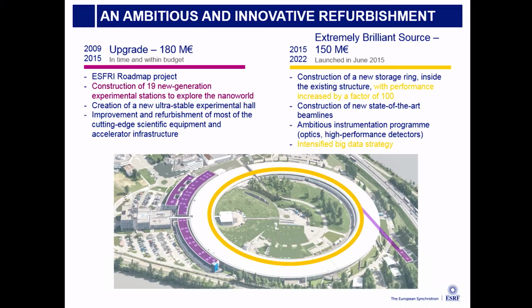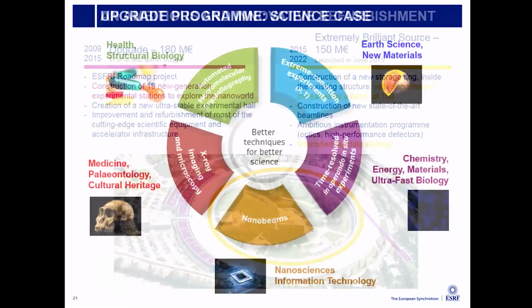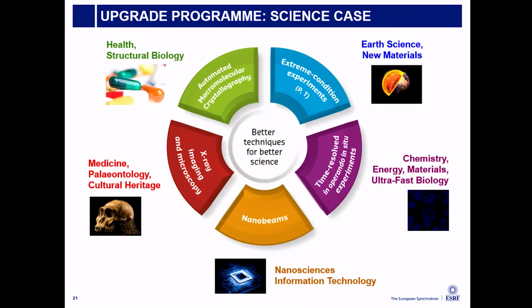It does mean that we'll be closing down in December 2018 for 18 months, just as MAX IV is, I think, probably largely available. And this is going to be a very exciting period for the ESRF, and this will make us the most brilliant source in the world in August 2020 when we come back up. A lot of the science drivers for this work needs microscopy. In there is a big one, it's health and structural biology, medicine over here, but there's also new materials, be they for medical devices or for composites for cars or for batteries, or we can start looking at very, very fast biology. Not as fast as the FELs, but fitting in between synchrotrons and what the free electron lasers can do. And this will be coming up with a set of even more beamlines, as I said, in about 2020.